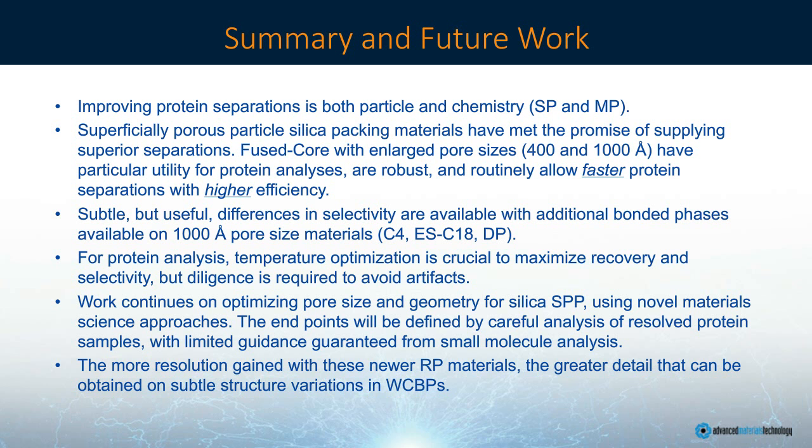Subtle but useful differences in selectivity are available, and additional bonded phases are available on the 1,000 angstrom pore size: C4, diphenyl especially, and C18. For protein analysis, temperature optimization is crucial to maximize recovery and selectivity, but diligence is required to avoid artifacts in the example of the higher temperature analysis.